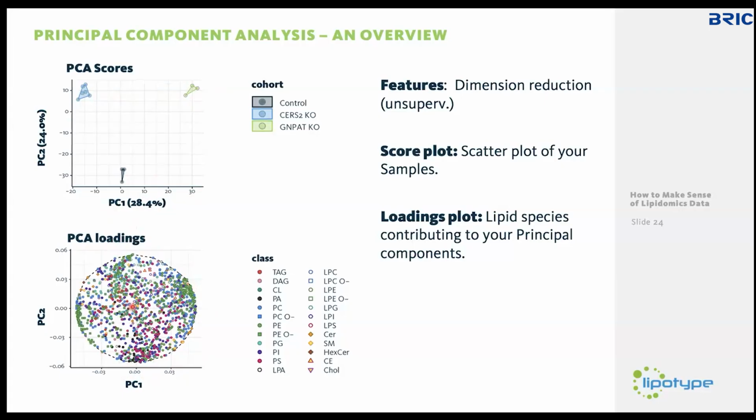the whole space. And what you notice if you have a keen eye is that because we have an enzyme that is responsible for ether lipid synthesis knocked out here, you see that the circles, for example the green circles, are all on that side, while all the green squares are on that side. Doing little distribution curves over there usually also helps spotting this. But yeah, you're actually looking for patterns that jump out at you to see if there's something general in the data.